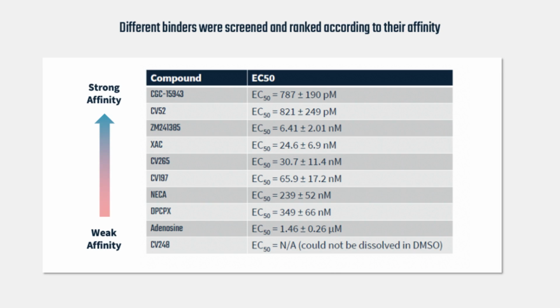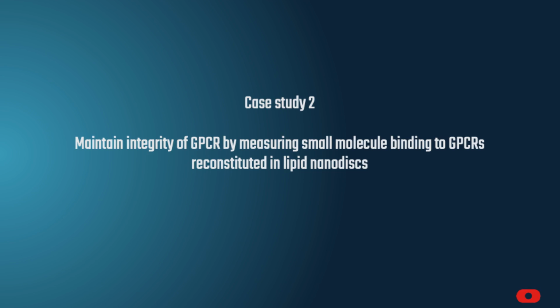Now I would like to share another example. In the first one, we were speaking of an example in the drug discovery field, but of course there is still a lot to be uncovered about the mode of action of GPCRs. In this second example, I would like to share how the Monolith instrument, here not the Monolith X but the Monolith instrument with the microscale and MST technology, was used to measure interaction of GPCR in nanodisc.